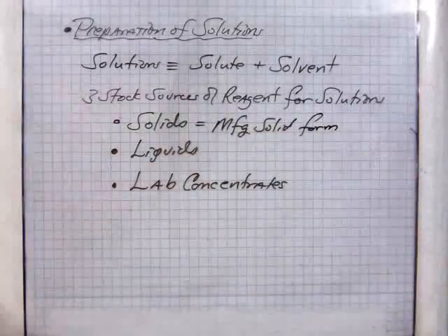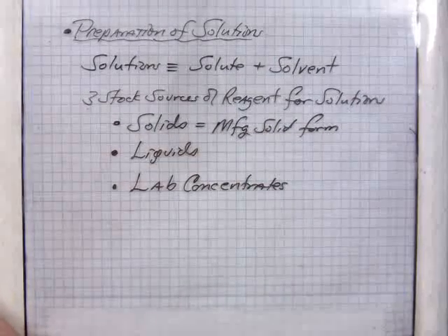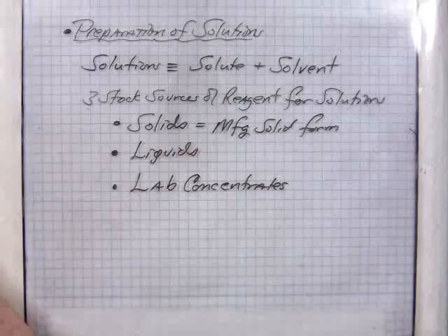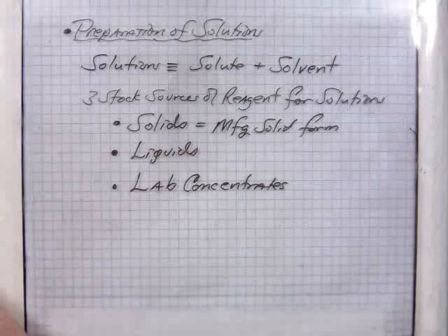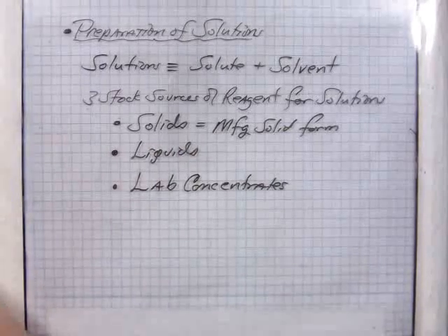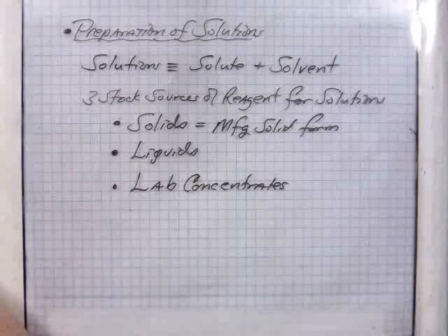And typically it will come to you with an assay sheet identifying its purity, its structure, and also include a material safety data sheet, as we used to call it, a safety data sheet now. But anyway, the MSD sheet for the substance should be reviewed.